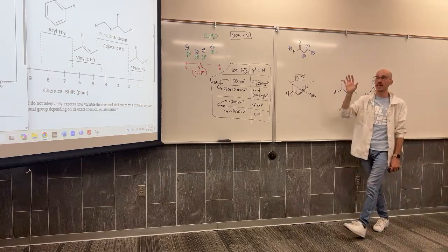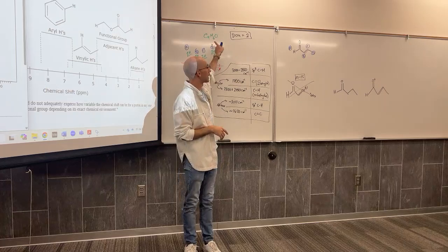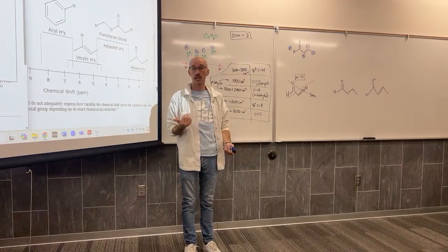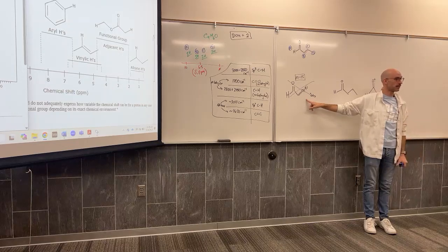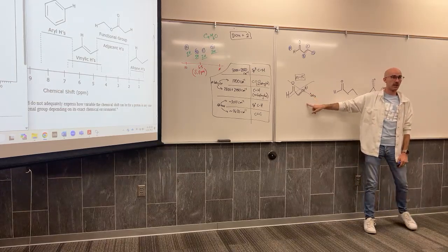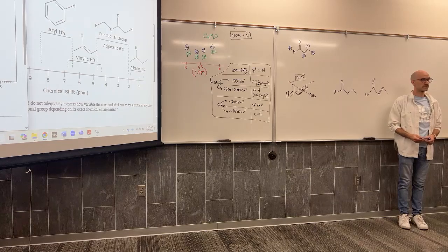What we have just done was taken an IR and an NMR for an unknown compound. Given its chemical formula, we identified all of the major bond types, which helped us predict functionality. We used NMR to actually confirm some of that functionality, and then we used NMR to confirm the structure. And once we had the structure, we predicted molecular ions. That's your unit test this weekend. No tricks. Those 3, 4 things.